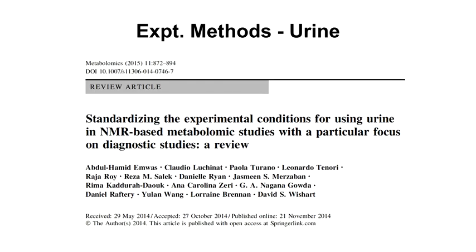There are certain protocols that have now been published for how one should handle or process different biofluids. There's a paper that we published last year on experimental methods for urine. It's a consensus paper that brought in a number of leading NMR spectroscopists who've been doing metabolomics for a while, identified issues and came up with a number of recommendations. So if you're working with urine, whether it's human or rat or koala, it's still the same thing.